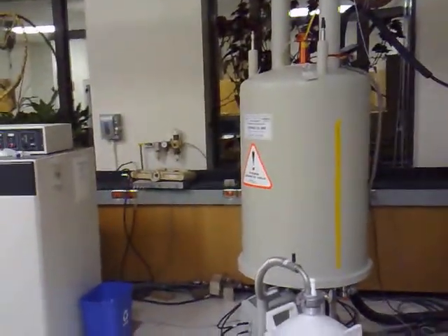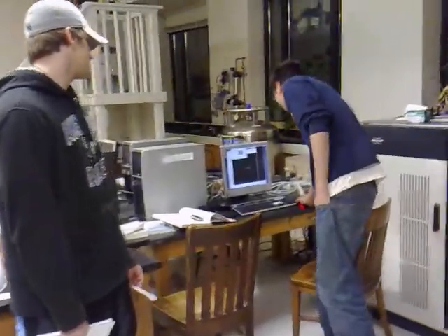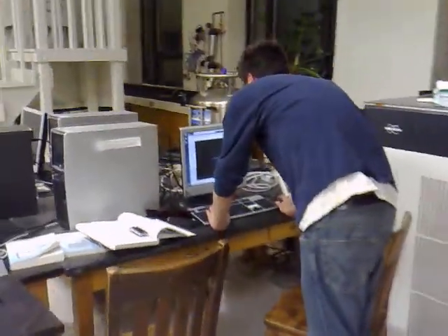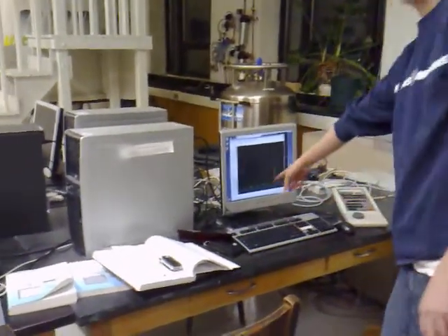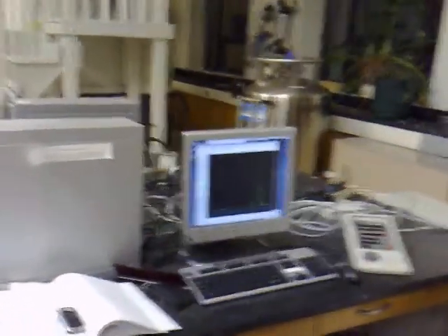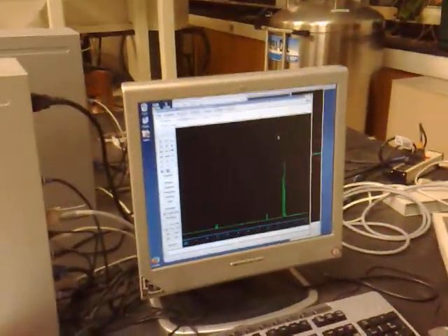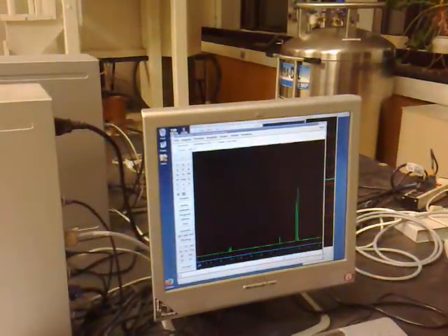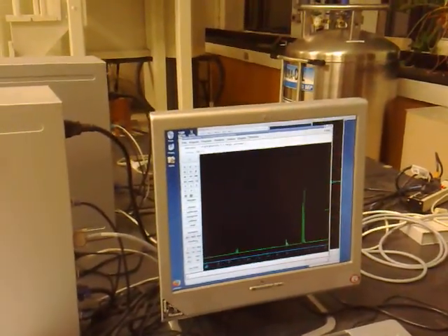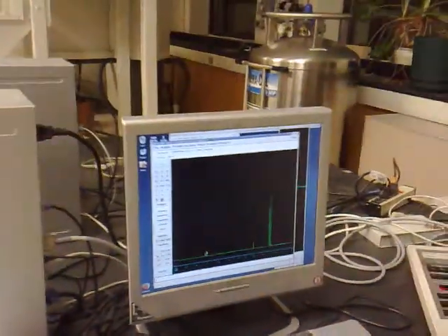We use these on a daily basis; they're pretty important to our research. We get a spectrum like this and print it out from the computer. Each one of these peaks is a different proton in the molecule. This is the solvent right here — this is toluene — and these peaks down here correspond to the compound.